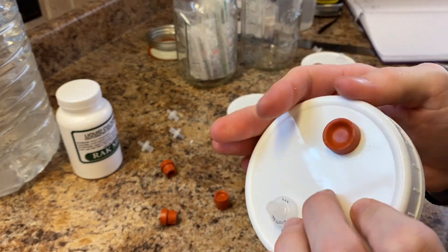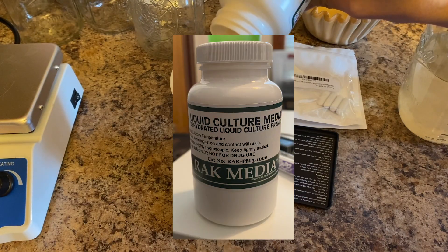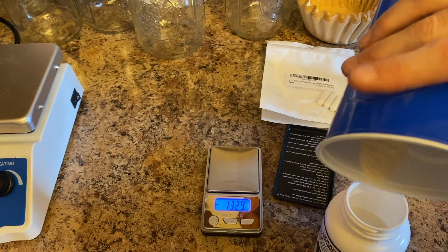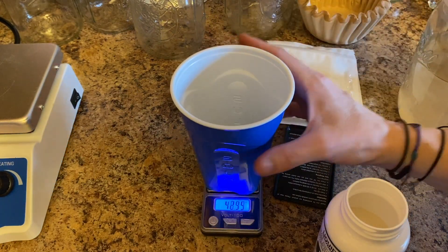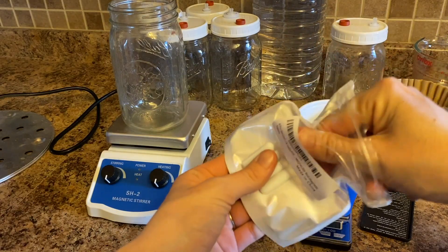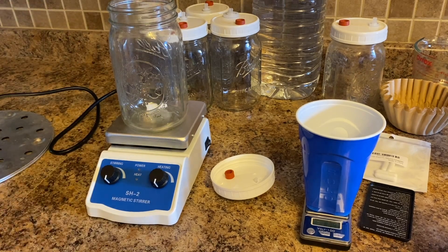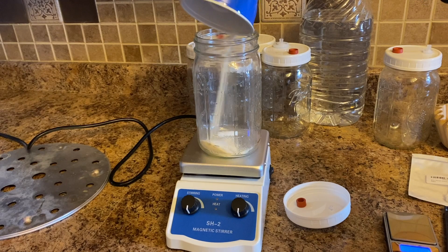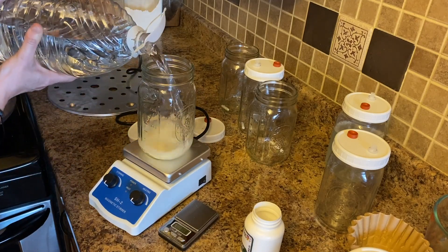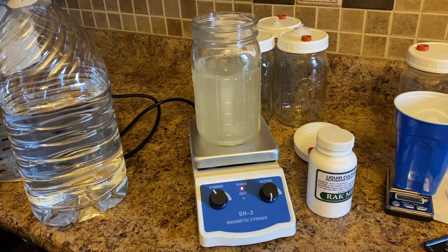Now that our lids are finished, we can start making our liquid culture. First, weigh out 8 grams of your liquid culture media. I am using a pre-mix from Shroom Supply, but any extra light malt extract will work. Next, we need to put our magnetic mixer in the mason jar. It's very important that you put the mixer in before you sterilize your liquid culture. Then add your liquid culture media to the 32-ounce wide-mouth mason jar, followed by 600ml of water. Thoroughly mix on a mixing plate until it's completely dissolved.